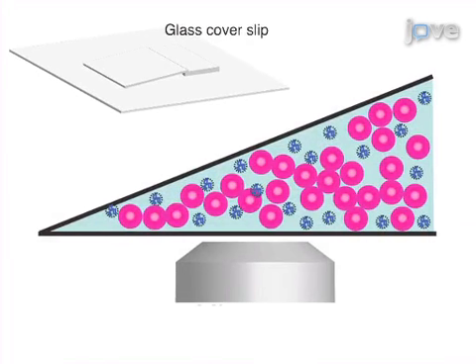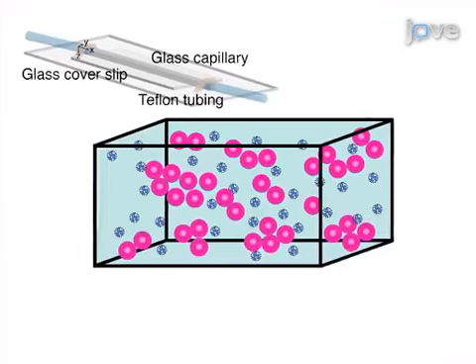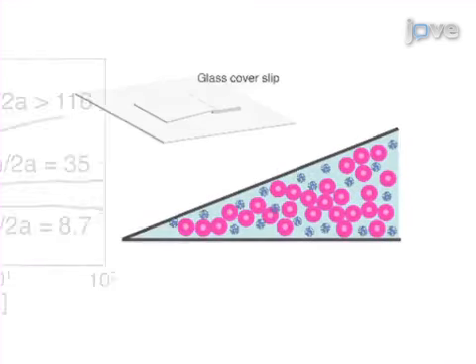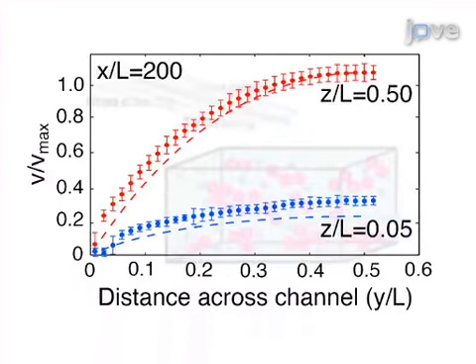behavior of these mixtures. Next, mixtures are imaged as they flow through microchannels to determine the effect of the strength of attraction between the colloids on the confined transport properties of the mixtures. Automated image analysis and particle tracking algorithms can show how quiescent confinement leads to solidification, and image correlation algorithms can show how increasing strength of attraction leads to increasingly non-Newtonian flow behavior.